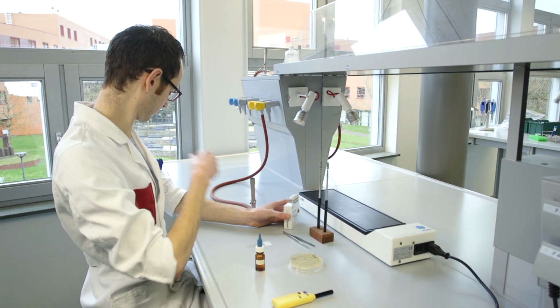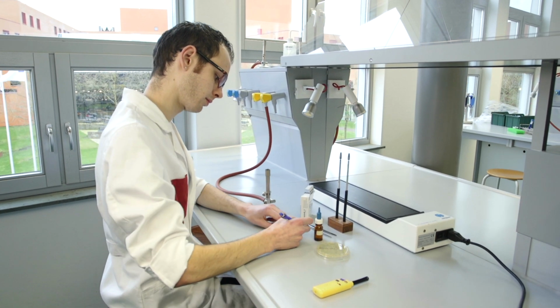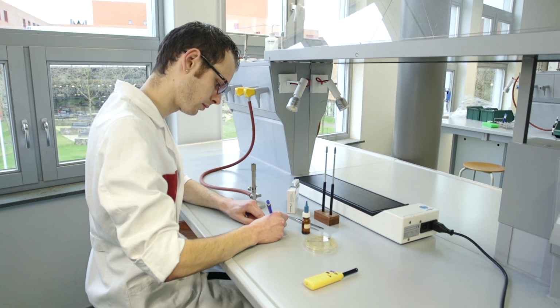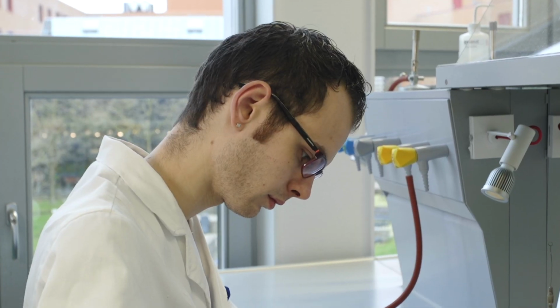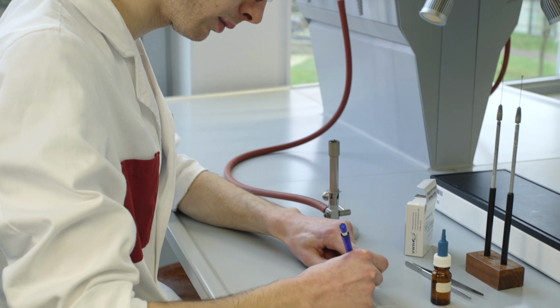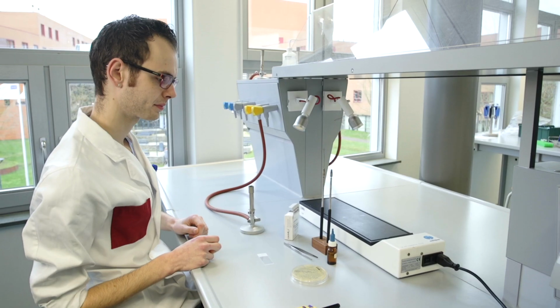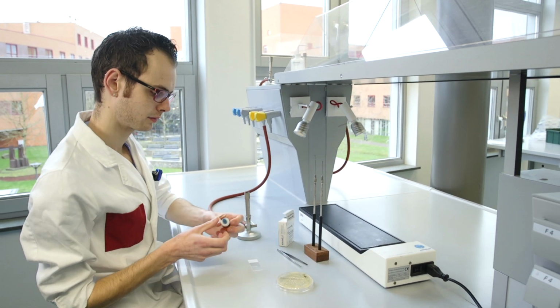If necessary, remove any grease from your slide with alcohol. Leave the slide to dry thoroughly before beginning the gram stain. Label the slide by writing on the matte surface. Use a pencil as it won't dissolve in the alcohol. Think about writing your initials, class, date, and the type of bacteria used.